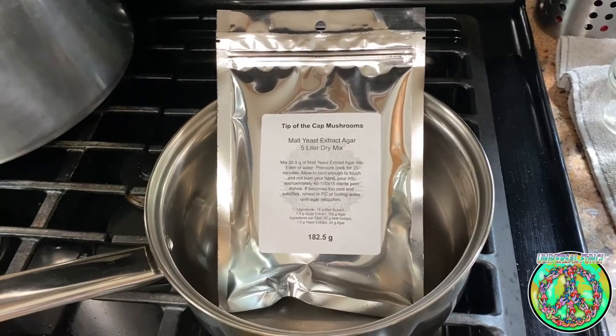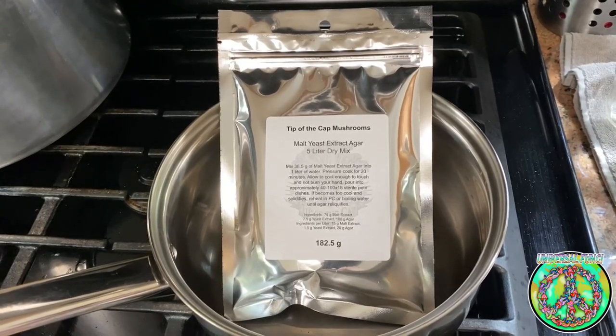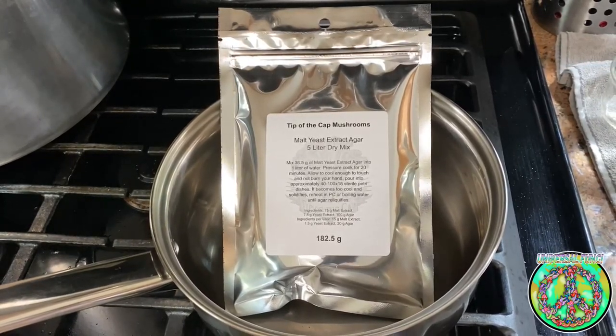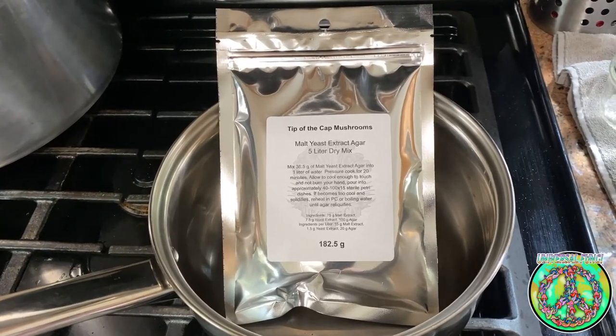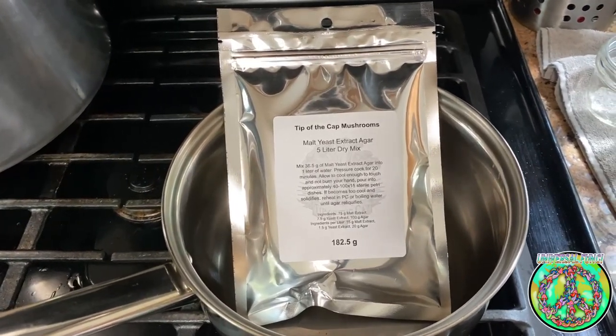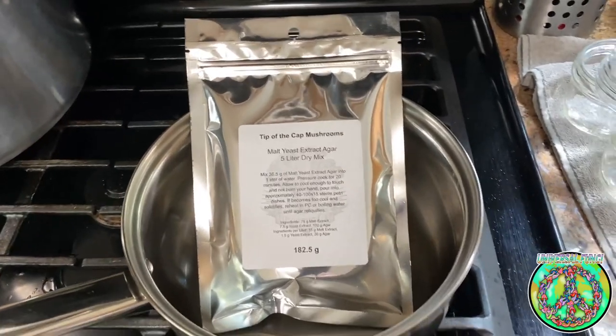The No Pour Agar Tech is done by pouring your agar before it's been sterilized. Usually agar is sterilized first and then poured into petri dishes in front of a flow hood or in a still air box. This method eliminates having to pour the agar in a clean environment.